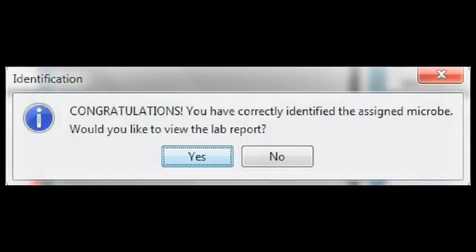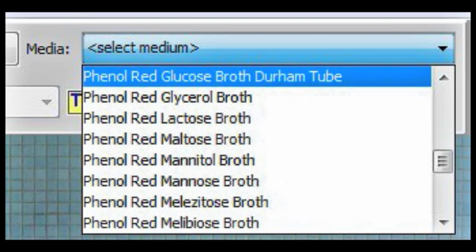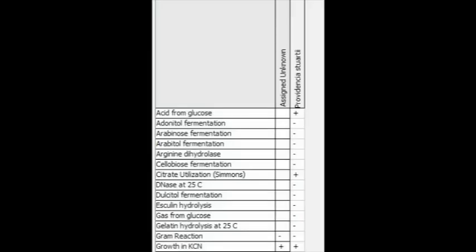But here is a quick overview of how identification takes place in general. You perform biochemical tests and record your results, and this actually is recorded into an identification matrix containing all microbes and all tests. The results of this will limit the possible organisms by eliminating all of those giving conflicting results. Then you go about finding additional tests in the matrix that will allow you to systematically reduce the list of possible identities for your unknown organism until only one possibility remains, and at that point then you have an identification.